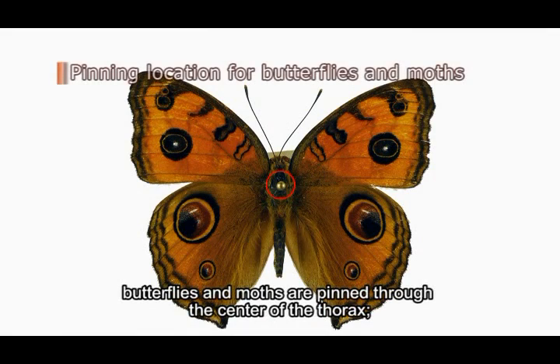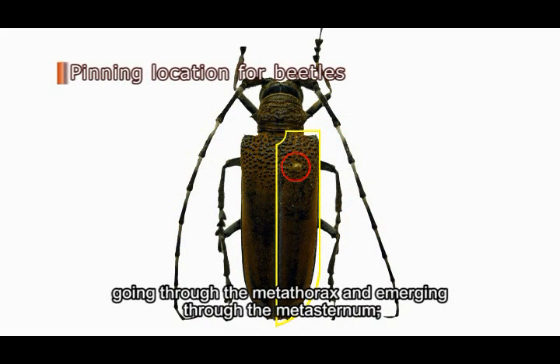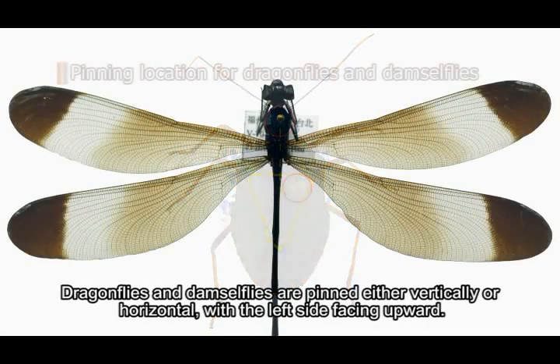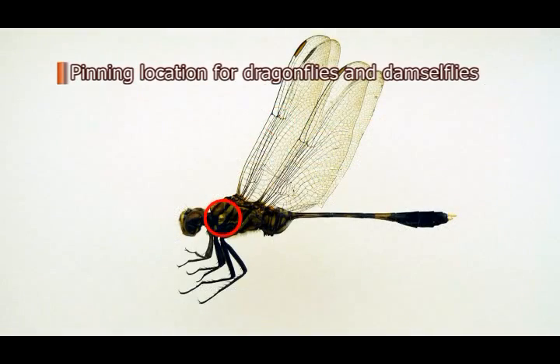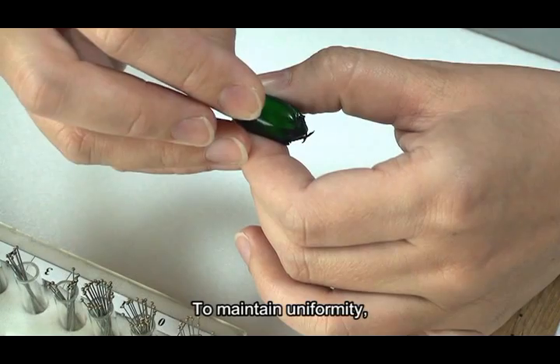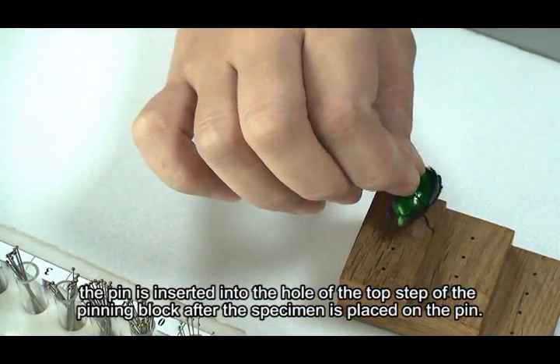For instance, butterflies and moths are pinned through the center of the thorax. Beetles are pinned through the right elytron, going through the metathorax and emerging through the metasternum. Grasshoppers are pinned through the posterior part of the pronotum, just to the right of the midline. True bugs are pinned through the scutellum. Dragonflies and damselflies are pinned either vertically or horizontally with the left side facing upward. All pinned specimens must be mounted at a uniform height on the pin, using the top step of the pinning block.